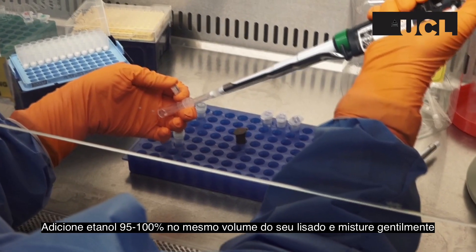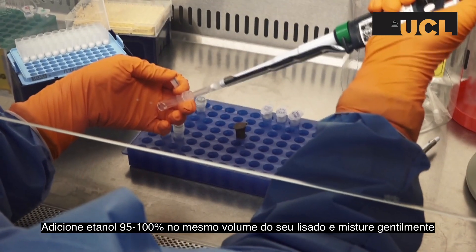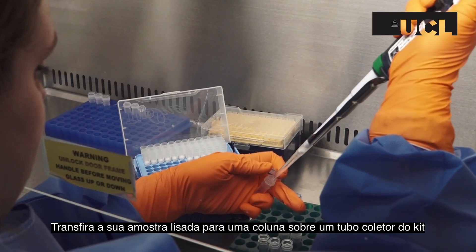Add an equal volume of 95 to 100% ethanol to your lysed sample and mix thoroughly. Transfer the lysed sample into a spin column which is placed within a collection tube.